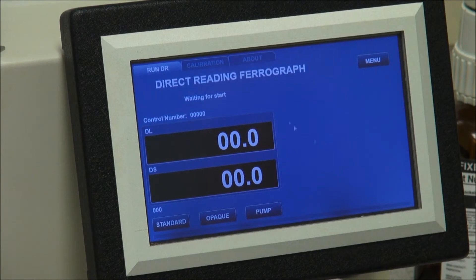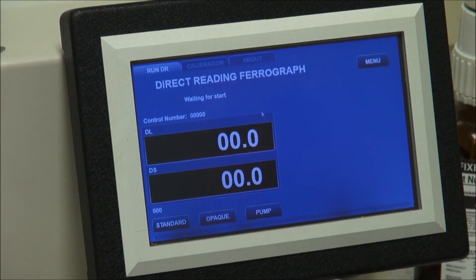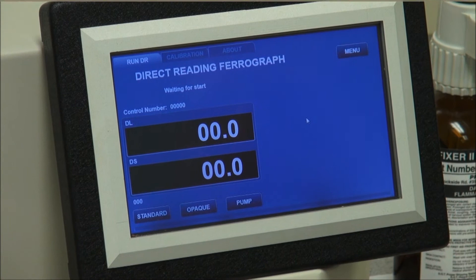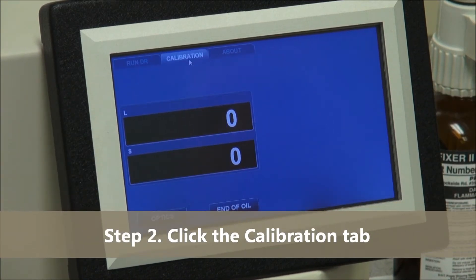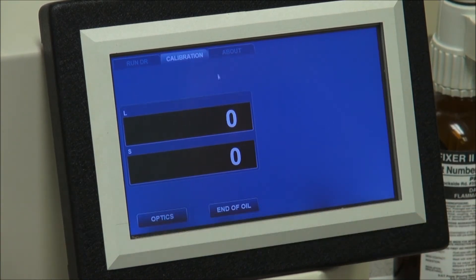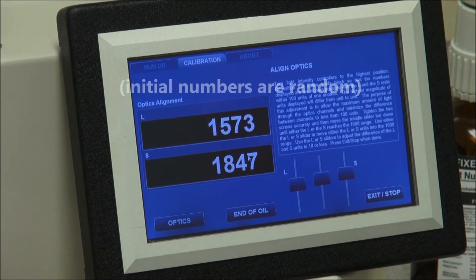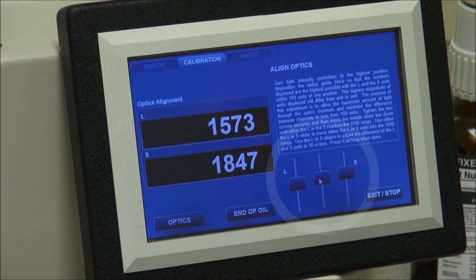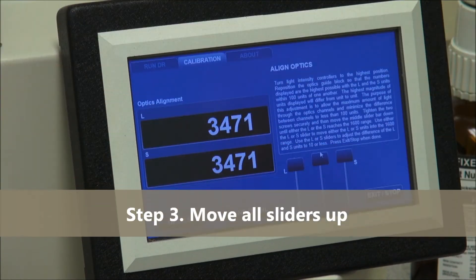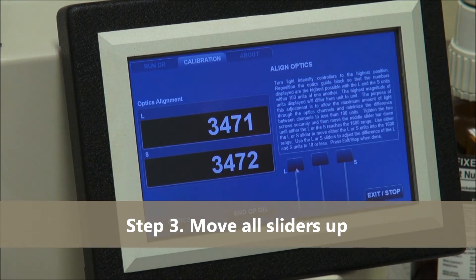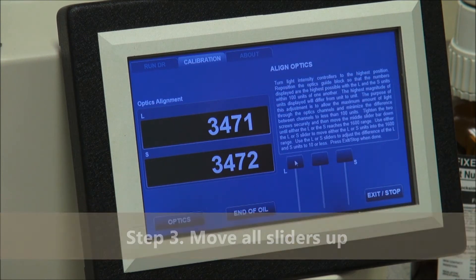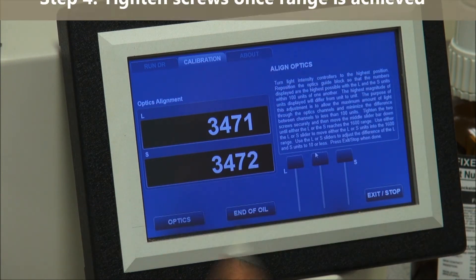Once the unit is powered up, the blue software screen will appear. Next we want to use the mouse to click on the calibration tab in the upper left hand corner. Then take the middle slide button and move it all the way to the top of the screen, making sure all three are at the top of the slide bar.